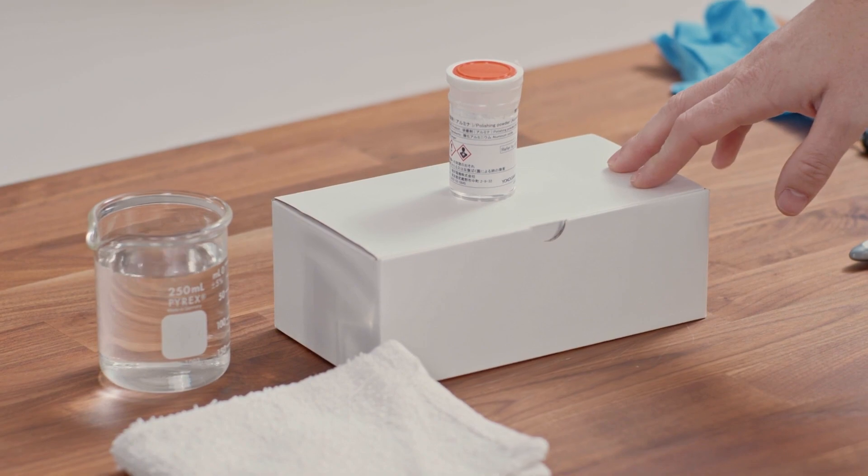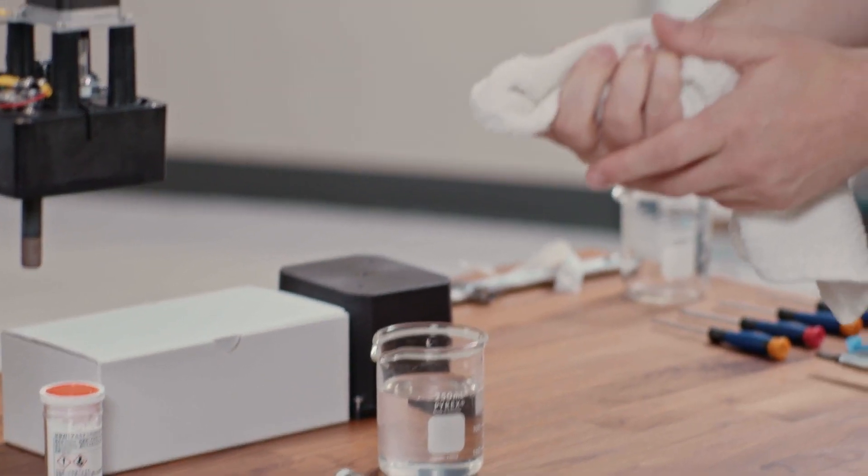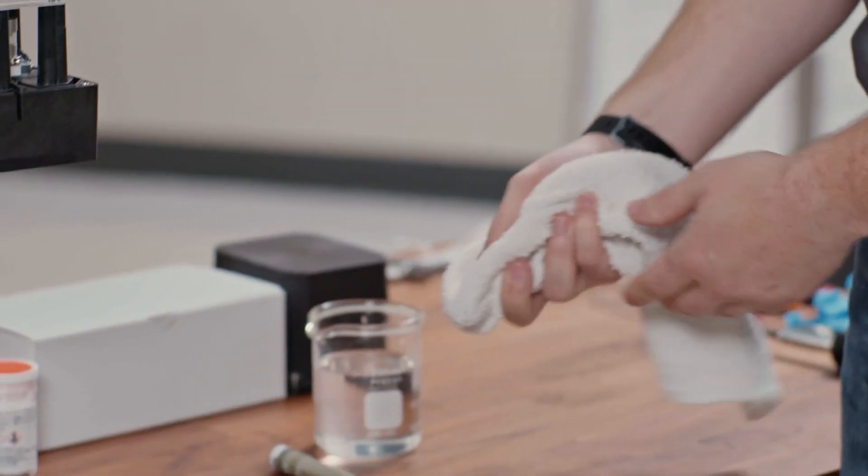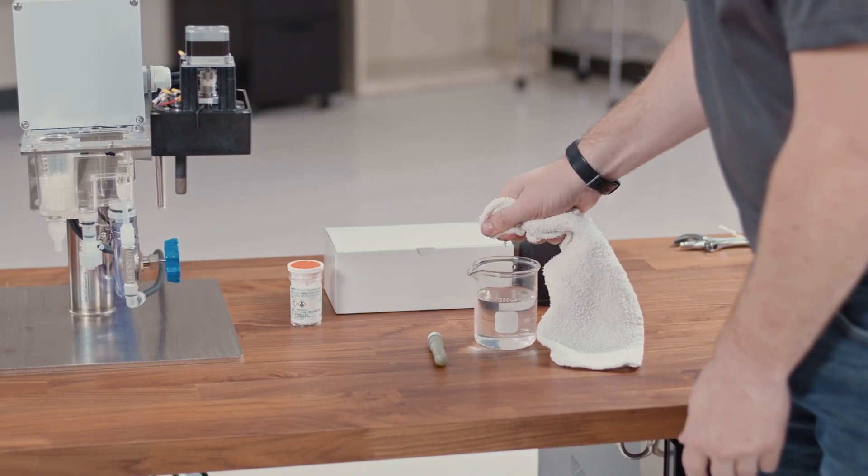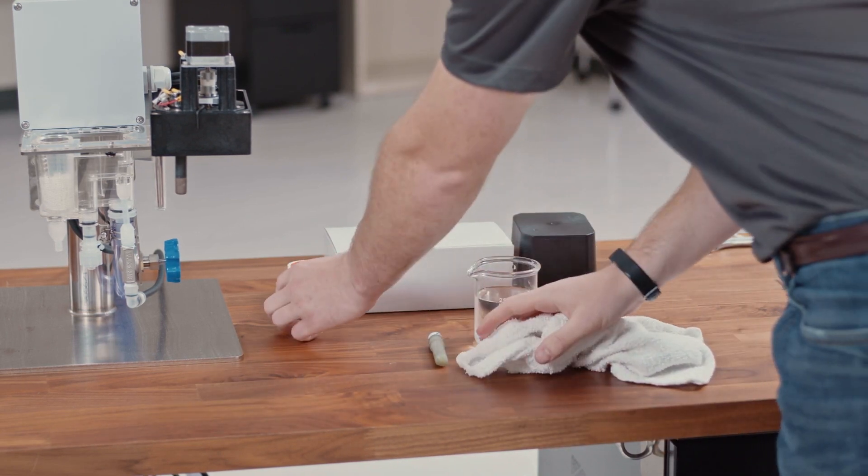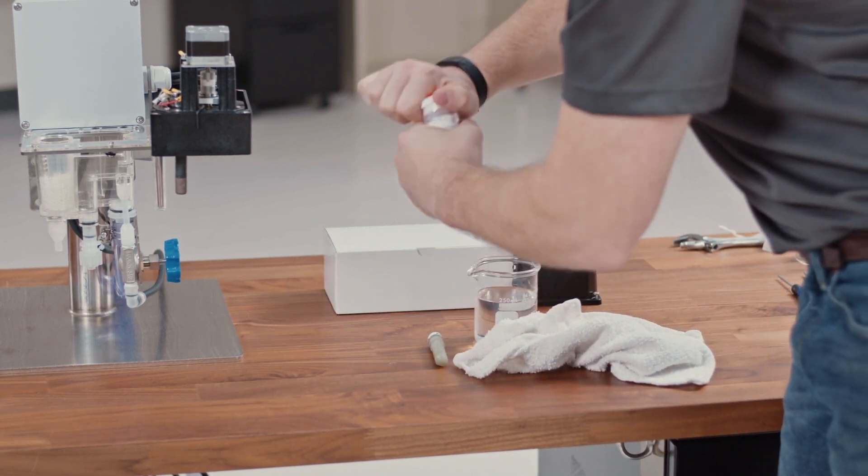You want to start by wetting a small portion of your clean cloth. You can just put it over your index finger and dip it into water. You don't need much water, just enough to provide some lubrication for the alumina oxide that is the abrasive in this case.